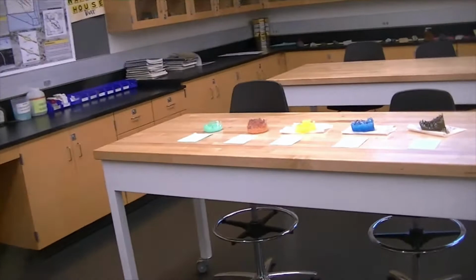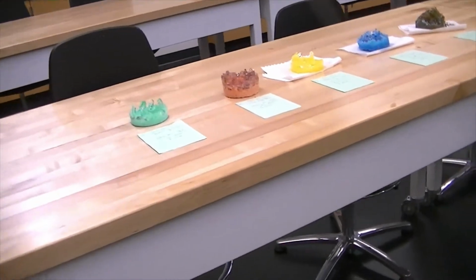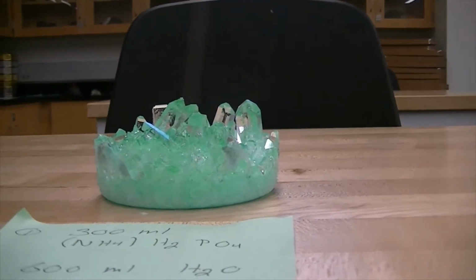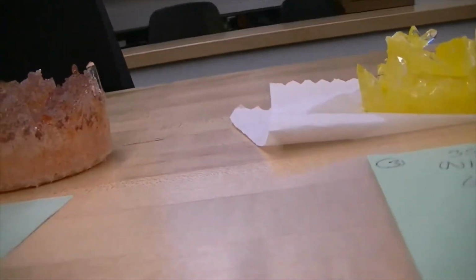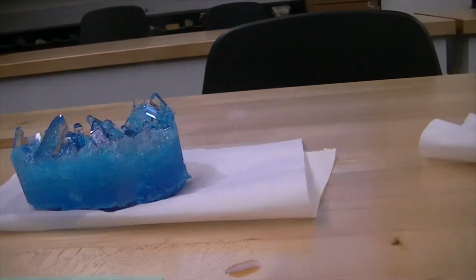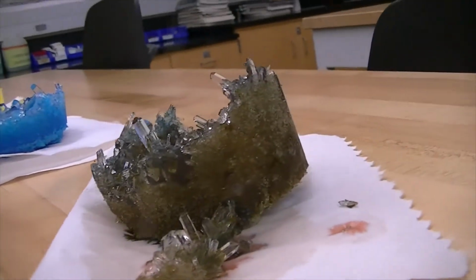So let's look back here and let's first define what this thick base is. So going over here, the base, you'll notice, varies. The lower concentrations of ammonium phosphate basically form a smaller base. And so a thicker solution will form these thicker bases. And a lot of this base was lost when I removed the crystals. The base basically separated. So the ones that had the larger bases were certainly numbers 4 and 5. And you can certainly see how number 5 had a very thick base.